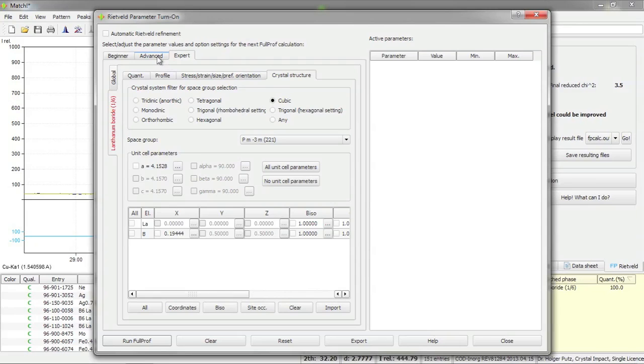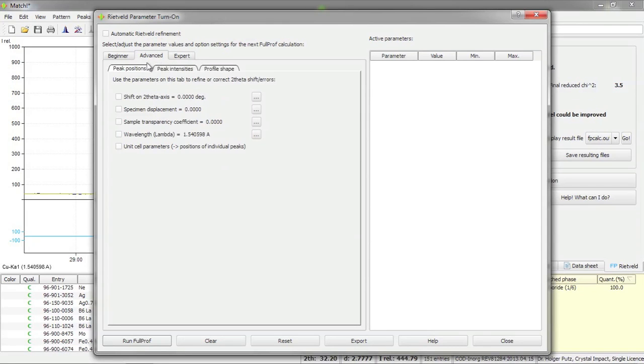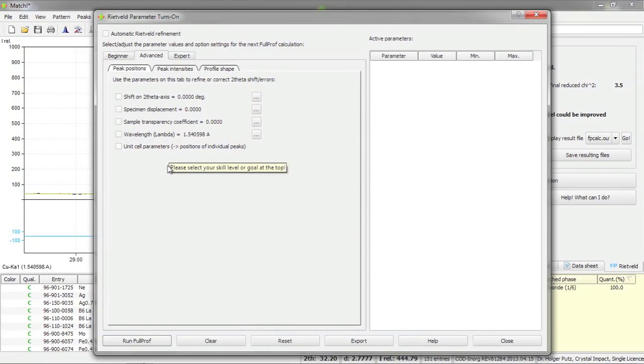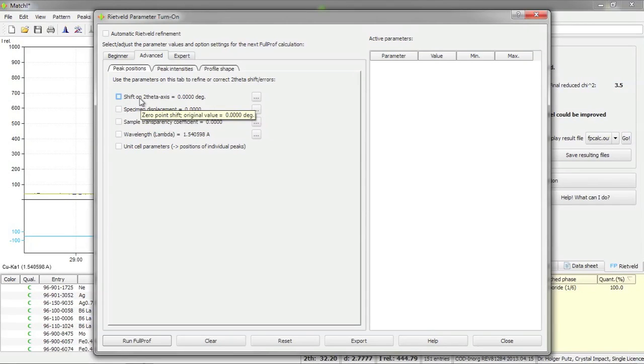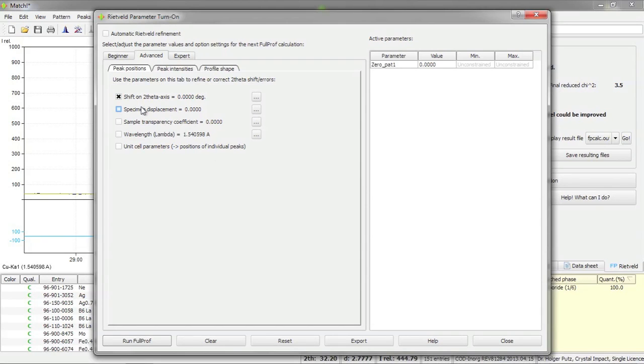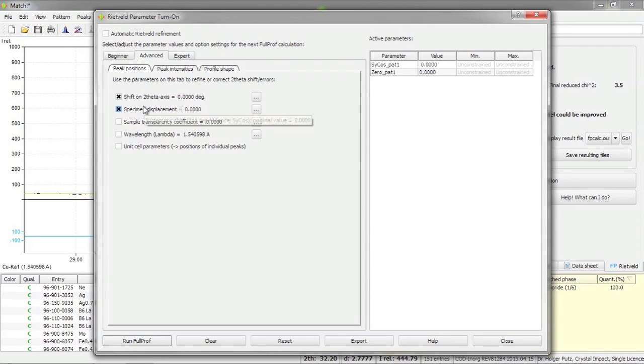For now I would like to use the advanced tab because I would like to refine according to the effects I have seen in the diffraction pattern. First of all I would like to refine the two theta shift and maybe I could also include the specimen displacement. I'm not sure if it will work to refine both parameters at the same time but let's see.